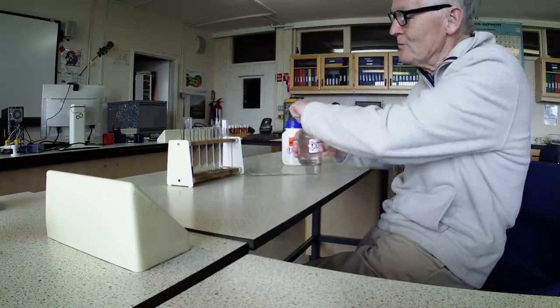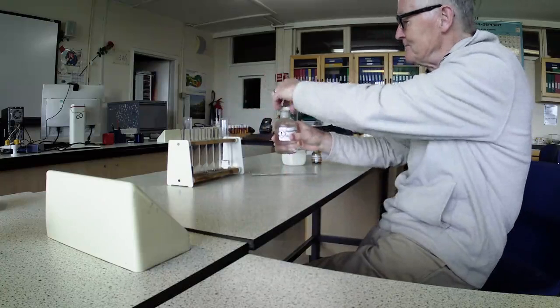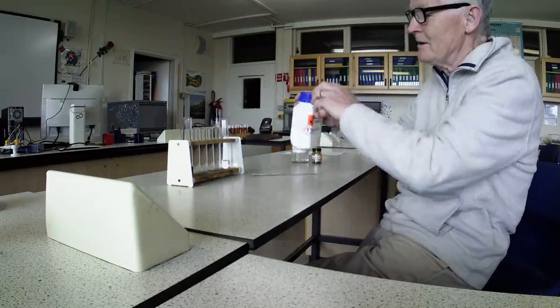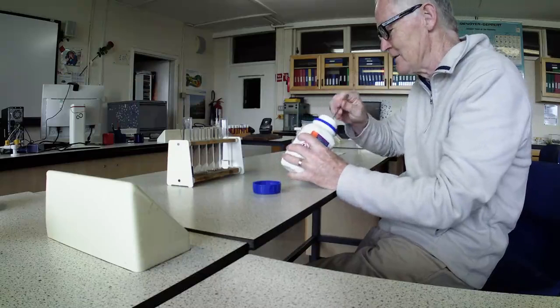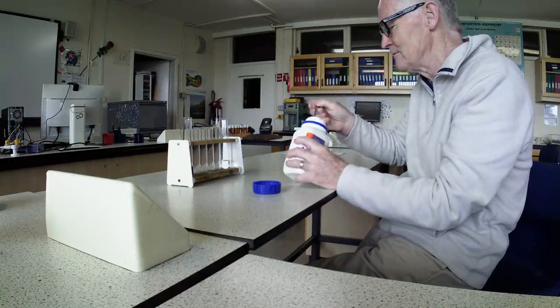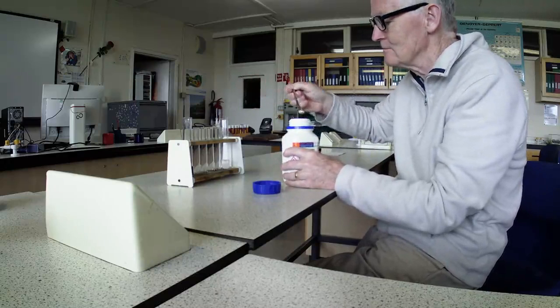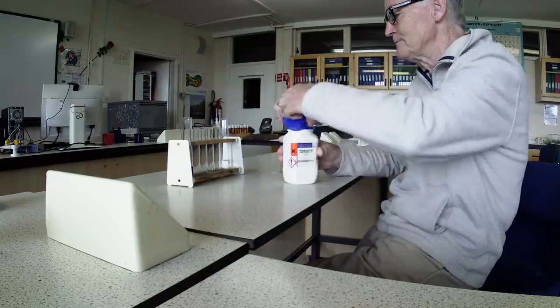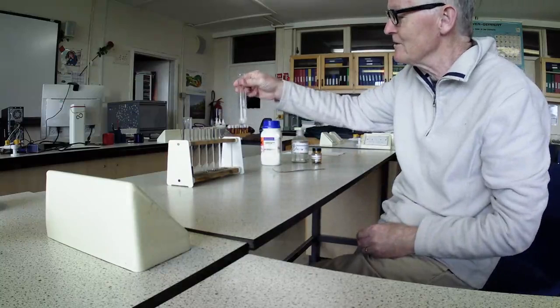The other solution I'm going to dissolve in hydrochloric acid. So there's hydrochloric acid, and we're going to put some sodium sulfite in with the hydrochloric acid. And we will get that to dissolve.